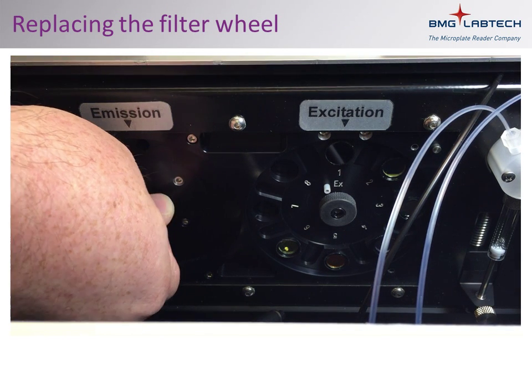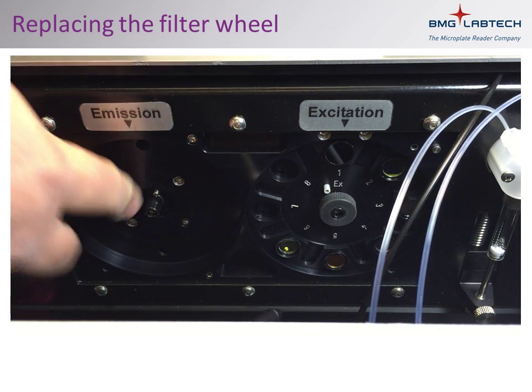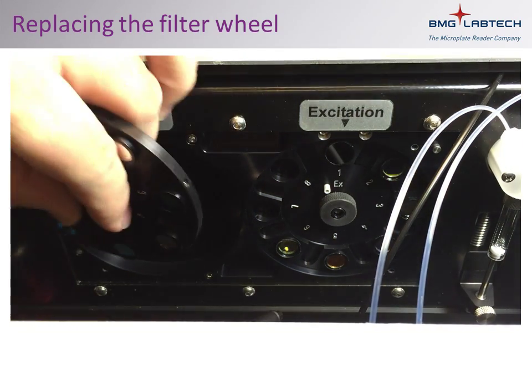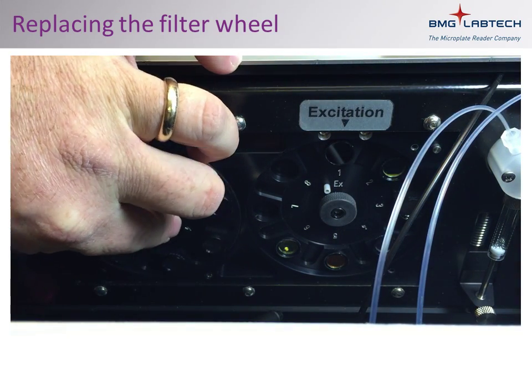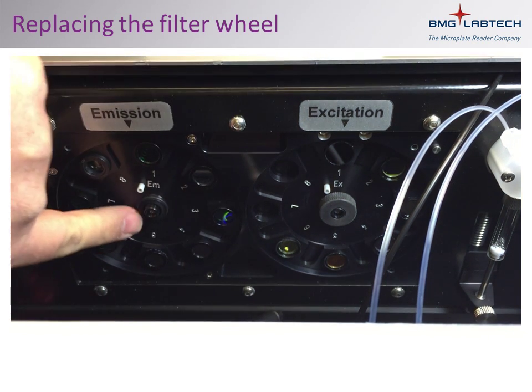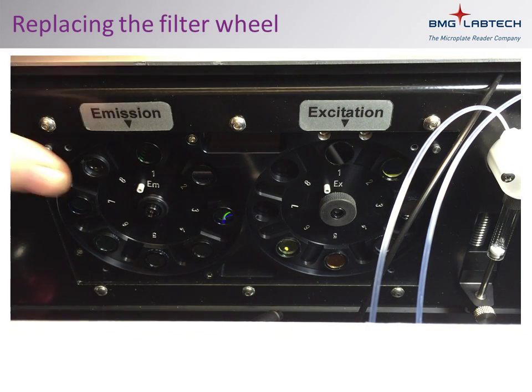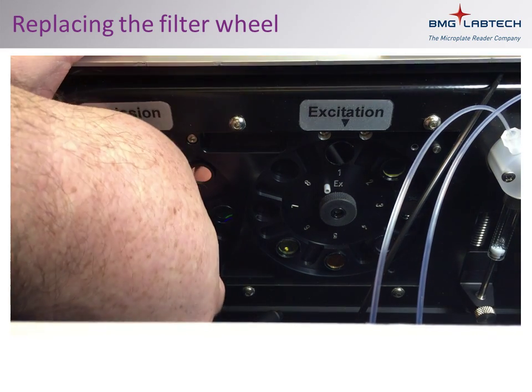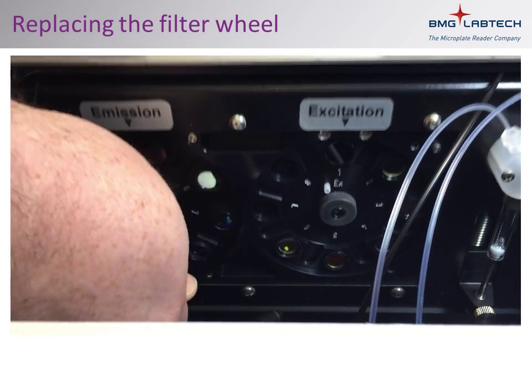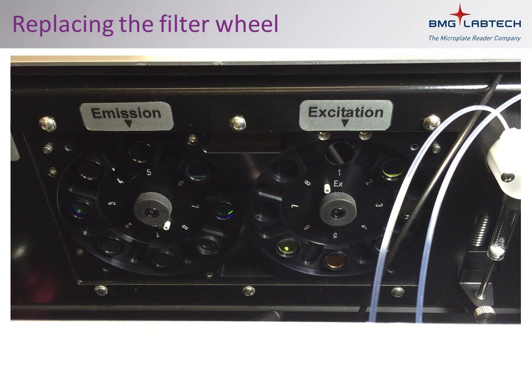When replacing the filter wheel, you will notice that there is a small positioning pin next to the axle. This pin will fit into one of the holes on the back of the filter wheel. With the filter wheel securely in place, tighten the retaining nut. If everything is in place correctly, the filter wheel will spin freely.